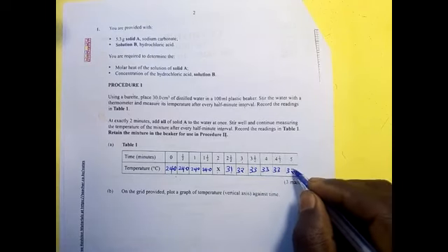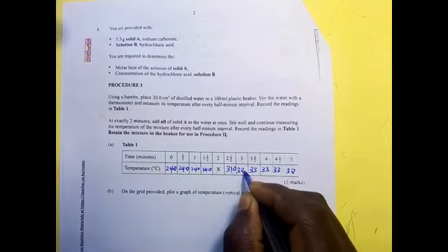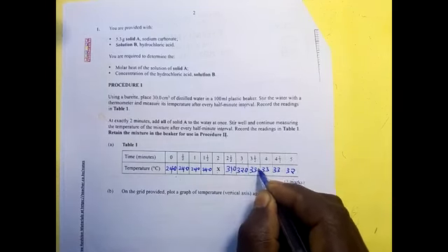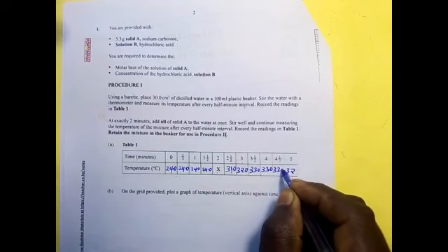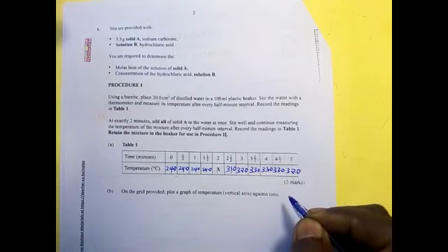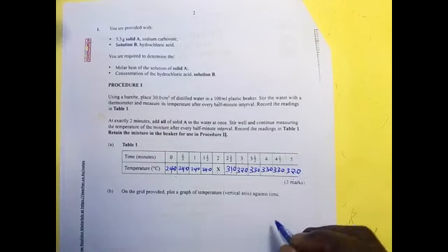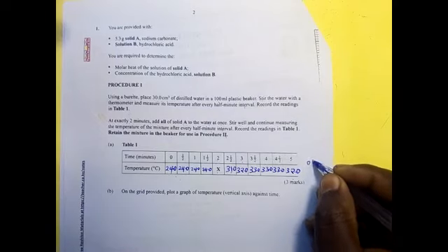There you have all the table filled. I used 1 decimal point. Please ensure if you use a decimal point, make sure that you use the decimal point consistently. So now this is our table. Here you expect to have 3 marks.